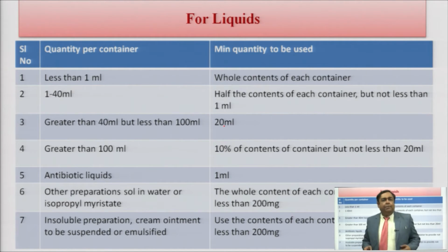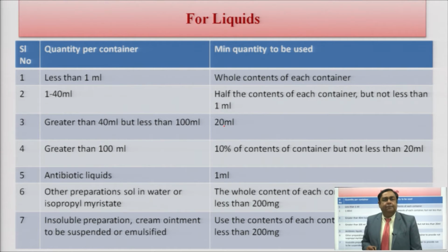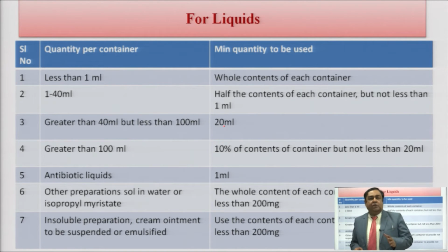Apart from antibiotic solutions, for all other preparations which are soluble in water, or in isopropyl myristate, you need to take the whole content of each container, but the quantity should not be less than 200 milligram; that minimum quantity must be present.